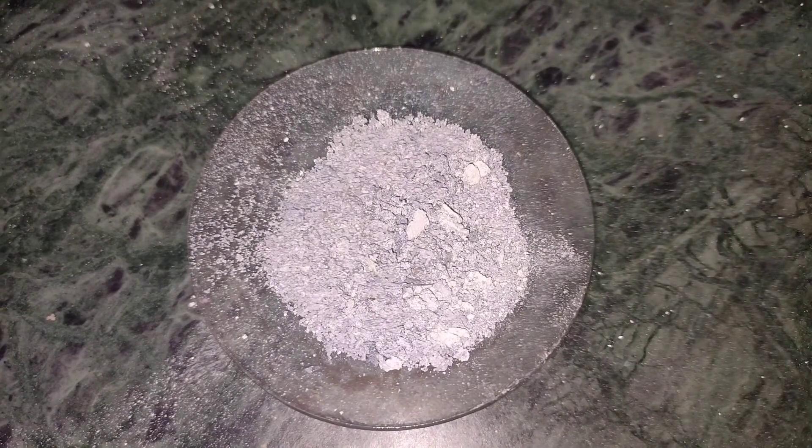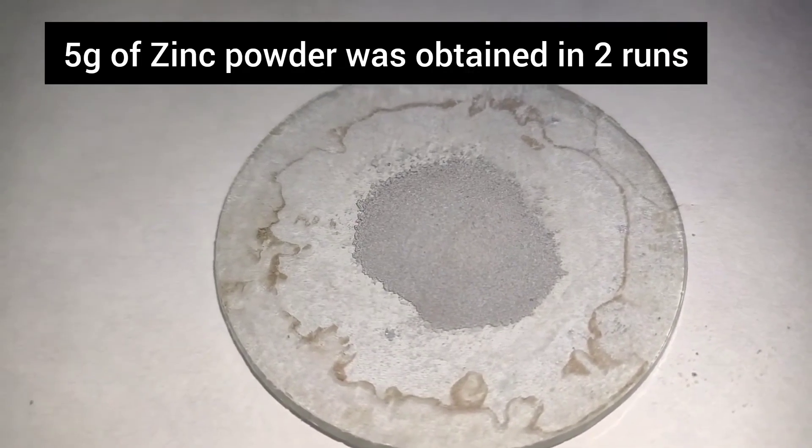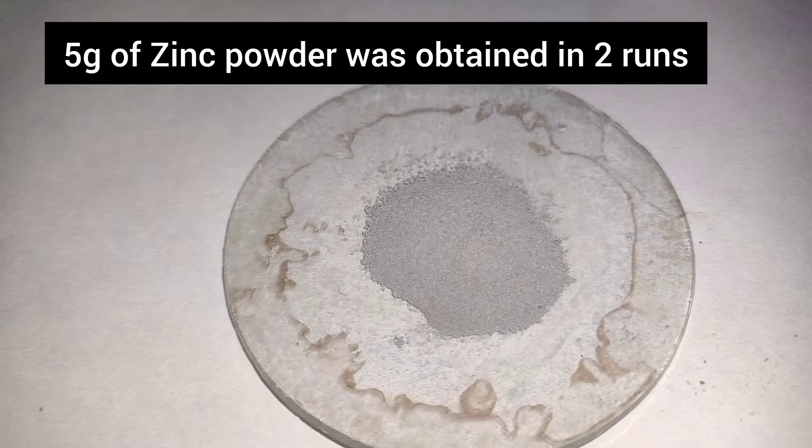After drying, I took out the crystals and with the help of a mortar and pestle I ground them to make a fine powder. The crystals were very brittle and ground easily. In total, 5g of zinc powder was obtained in 2 runs.